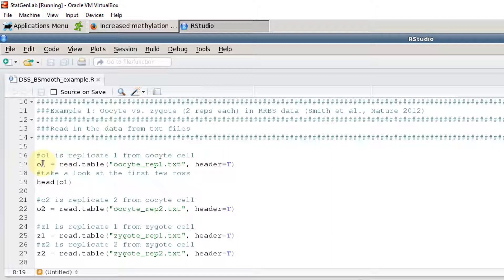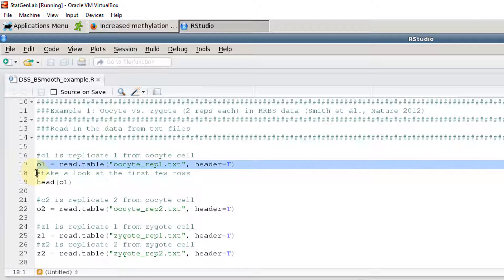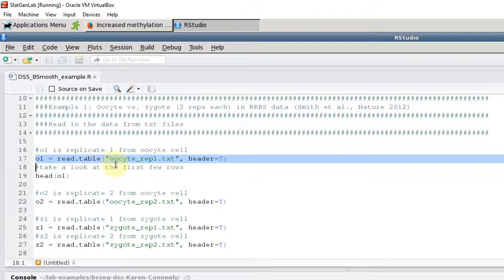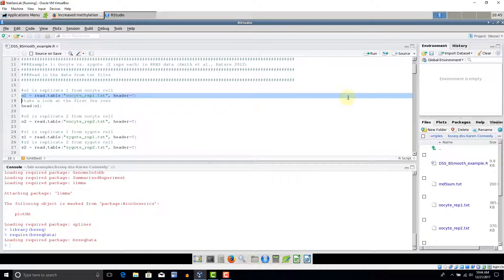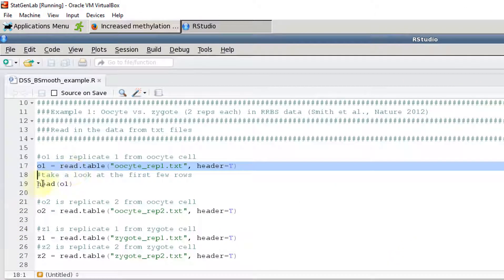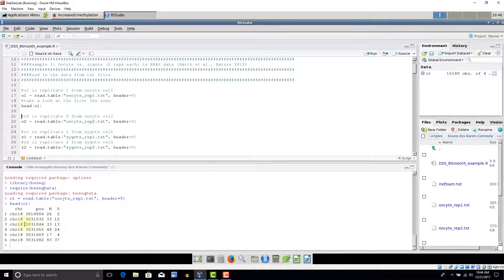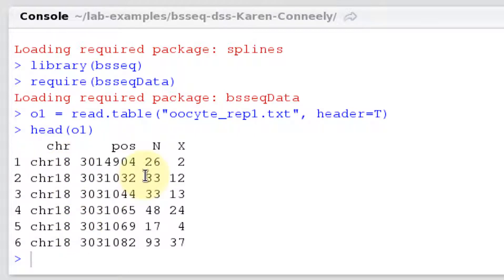Our first step will be to read the data in from the text files. We're going to use the read.table command to read in the file called oocyte_rep1.txt, which is the first replicate of the oocyte data. We'll have two replicates. I'll go ahead and run this and then inspect the data. We've defined an object called o1. Using the head command, we can see it has four columns: chromosome, position, capital N — the number of reads per position — and x, the number of methylated reads per position.